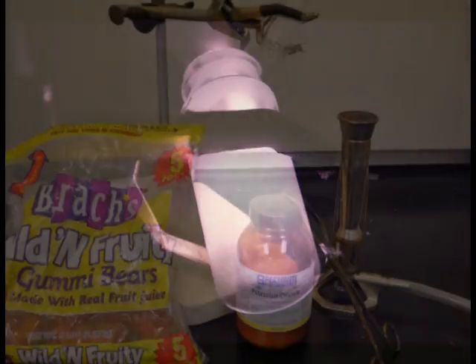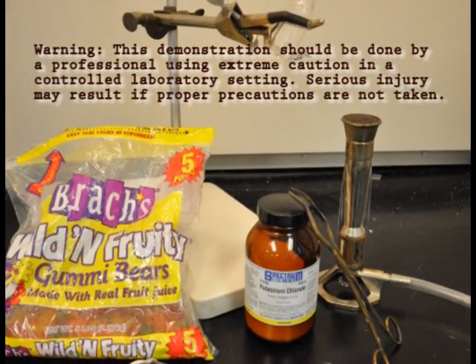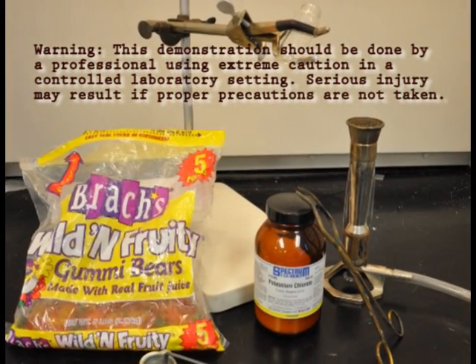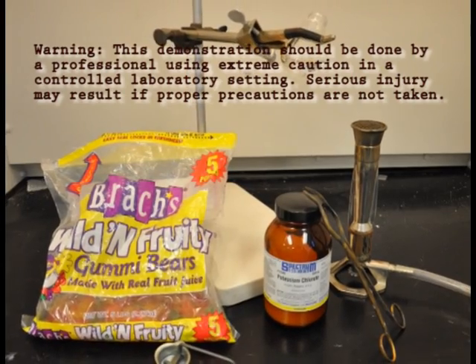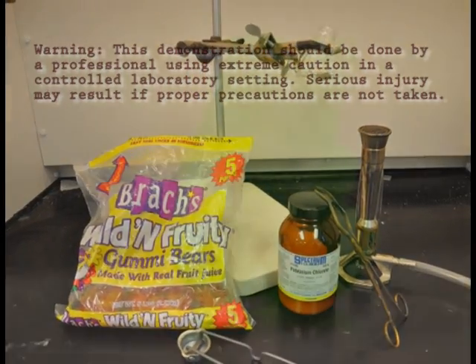The materials needed for the dancing gummy bear include potassium or sodium chlorate, a Bunsen burner, a Pyrex glass container, tongs, and of course one unfortunate gummy bear.